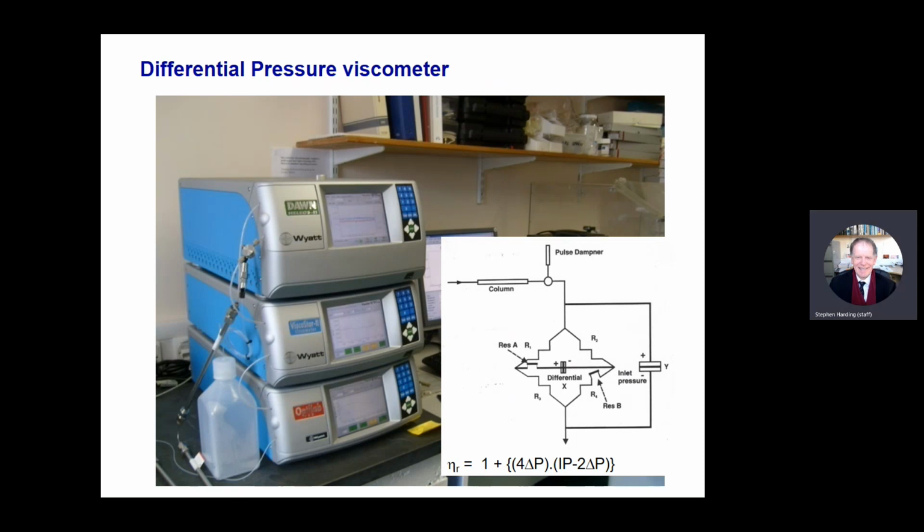So you need to go back to your notes we did on viscosity in an earlier recording and see where that comes from. So by using the Solomon-Ciuta equation, we can get almost instantaneous intrinsic viscosities coming out as the solution passes through the capillaries in the viscosity device, having come from the light scattering device.